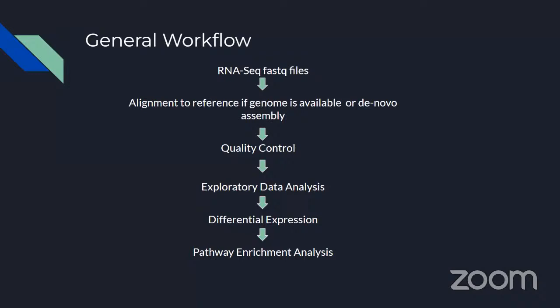For example, you're looking at two different cells. One cell is the control, and the other cell you have grown in a particular condition. You do a bunch of exploratory data analysis and look at a PCA, and there might be a few cells cultured under a given condition that group with the control samples. In such cases, we would want to remove them.